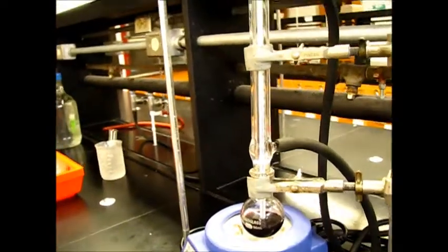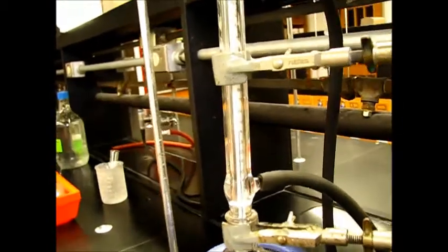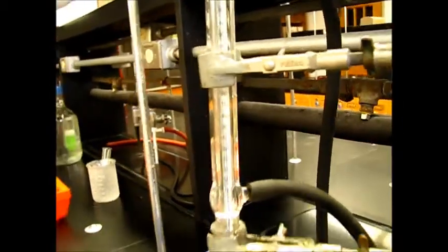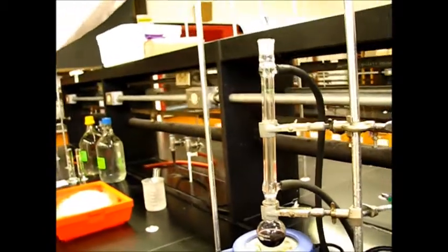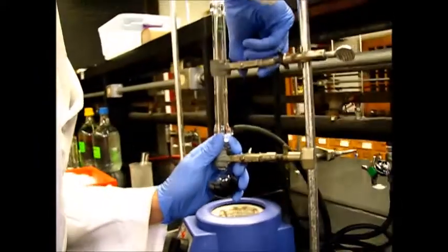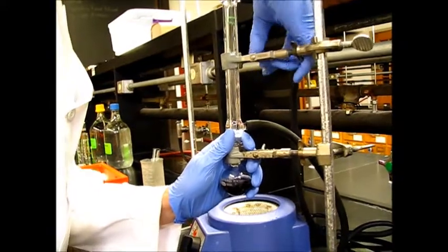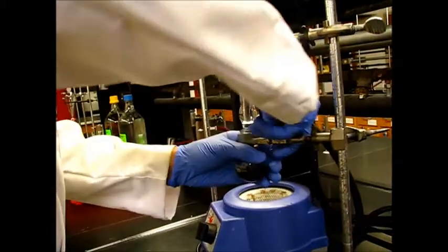So we've let it just kind of cool in the air for about 10 minutes. It's down to about 40 degrees Celsius. So we'll go ahead and take this off of the reflux apparatus and set the round bottom flask in this ice bath just to fully cool it down to room temperature. Make sure it's tight on there.